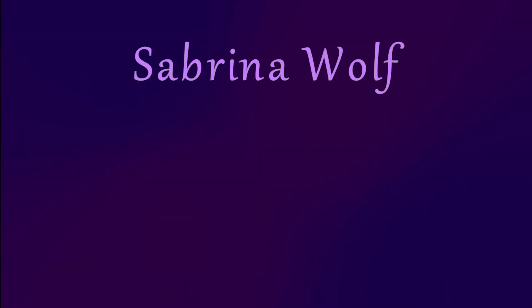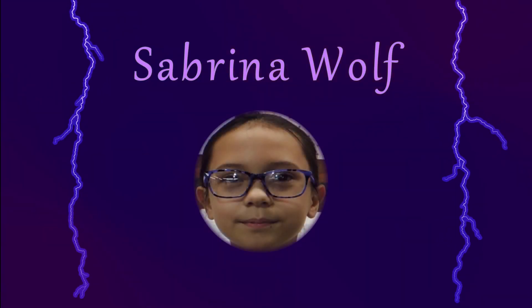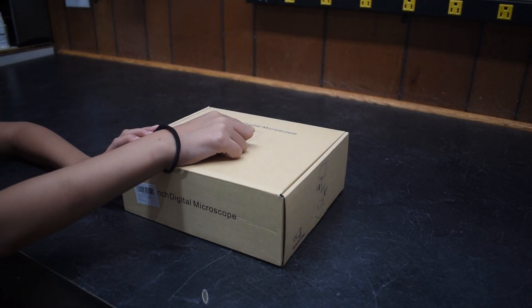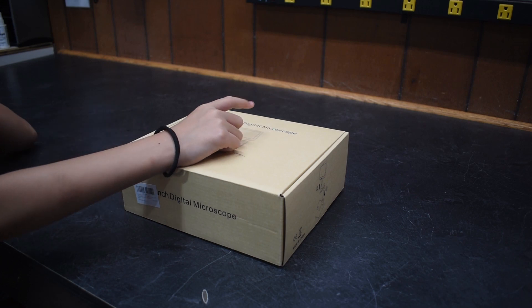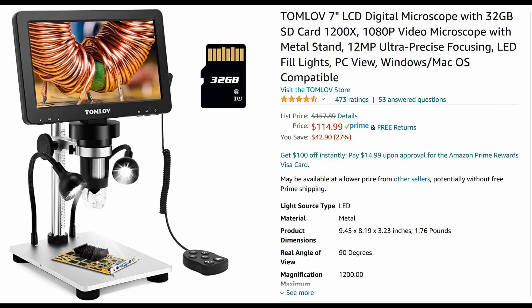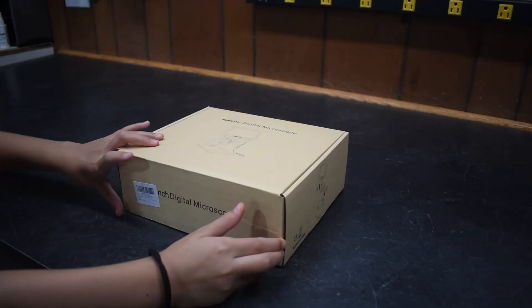Hi, my name is Sabrina. In this video we're going to unbox a digital microscope. This is a Tom Love digital microscope and we bought it off Amazon. And let's unbox.